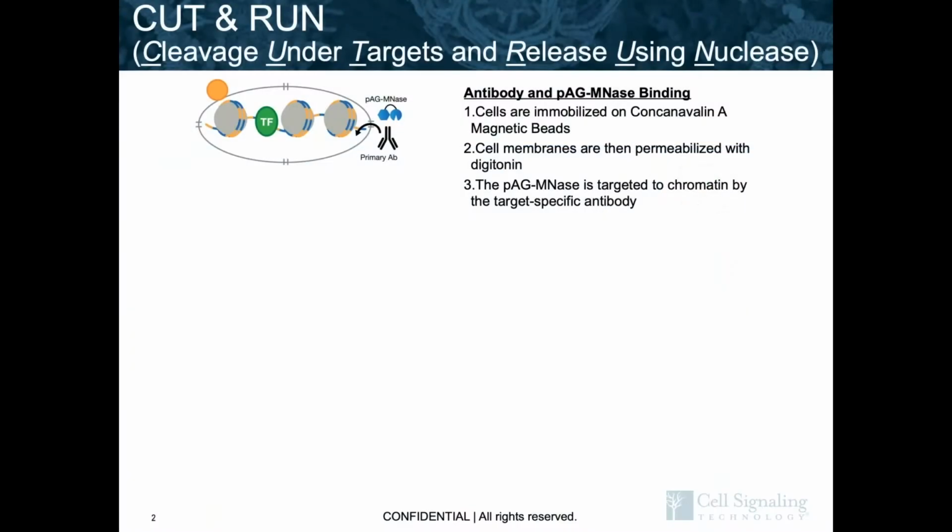As you know, just like ChIP, CUT&RUN is a powerful technique to reveal the protein-DNA interaction within chromatin. I hope to quickly go through the main steps of CUT&RUN so we can understand where the benefits come from. At the beginning of the experiment, we bind cells to the Concanavalin A beads to facilitate buffer change and cell wash. We have a very small amount of cells in CUT&RUN, so they are very easy to get lost during the spinning and the buffer change if not bound with beads.